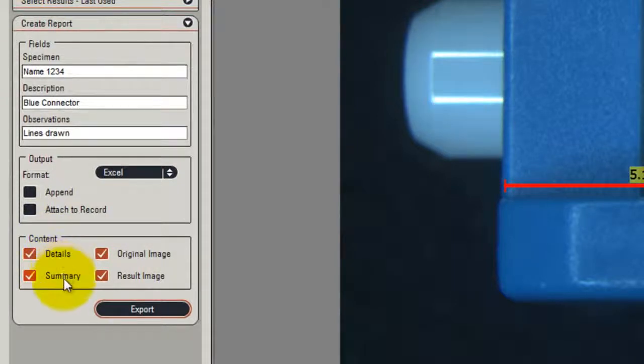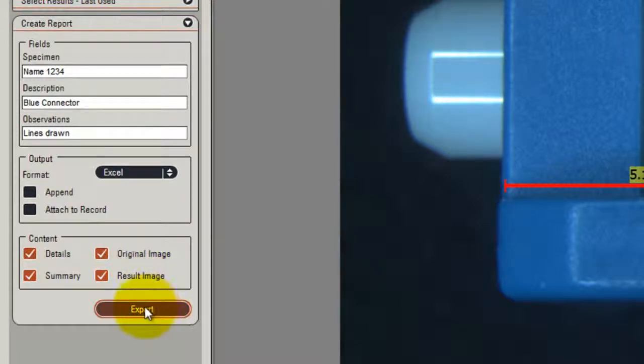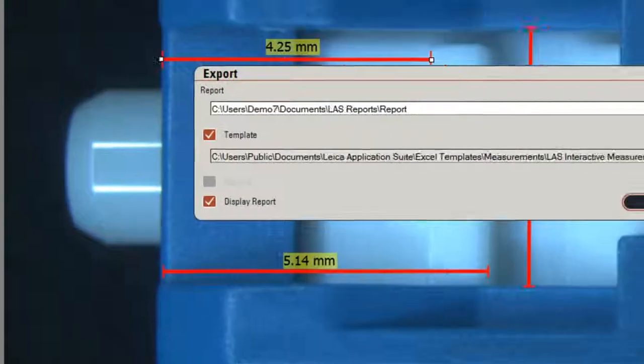I want to export all the content, the details, the summary data, that is the statistics, the original image and the result image. Then all I have to do is click Export.